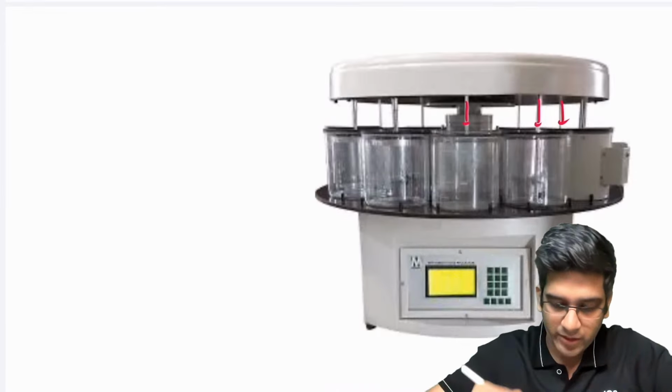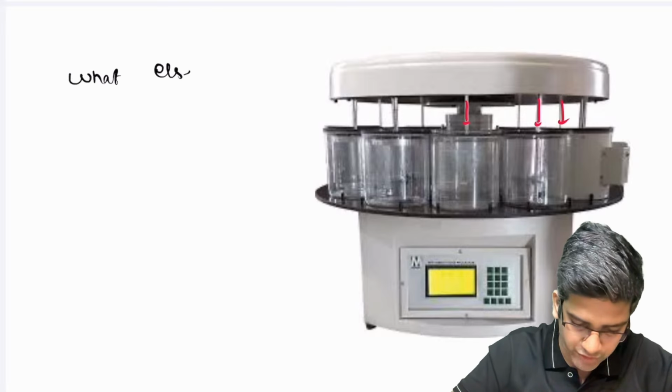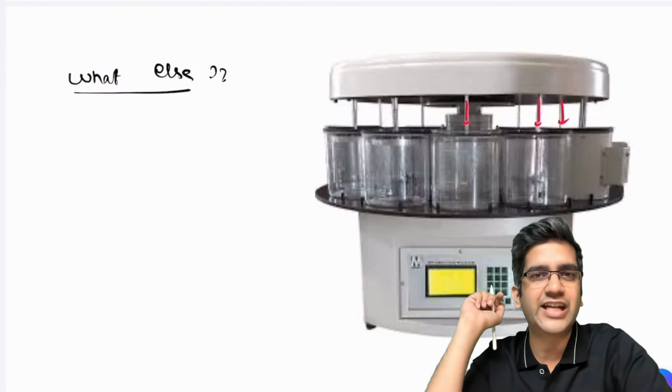So now the goal is here. We have to understand what else will be there in the tissue processor. What else fluid will be there in the tissue processor? Everything has a very specific requirement.